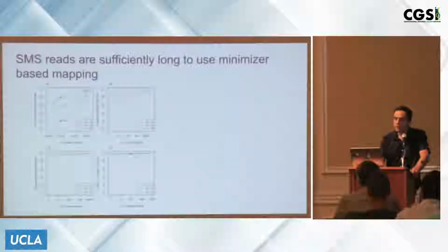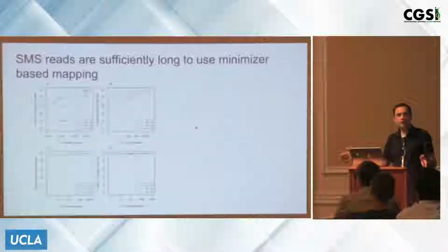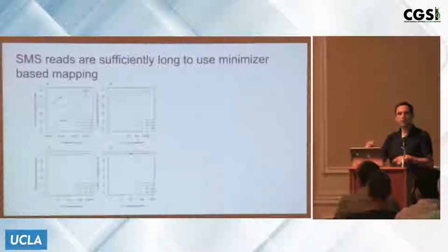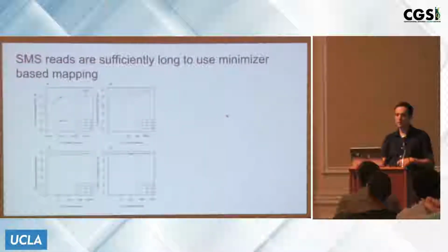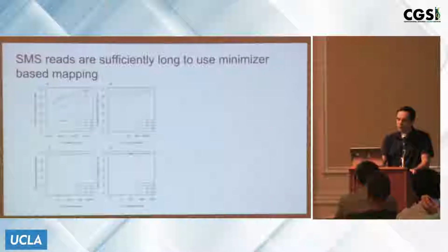What's shown here are 4 different examples where we have a query of 1,000 bases, and we're looking for the number of shared words between the query and the genome, and the number of other similar matches elsewhere in the genome, or the fraction of essentially unique calls within the genome.